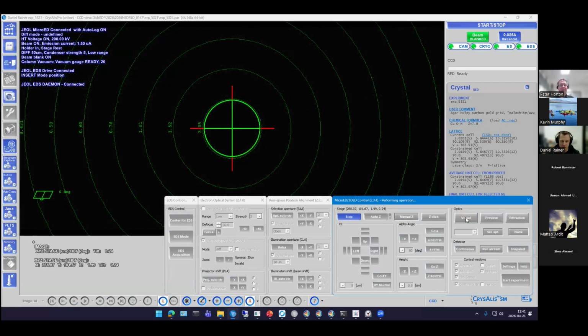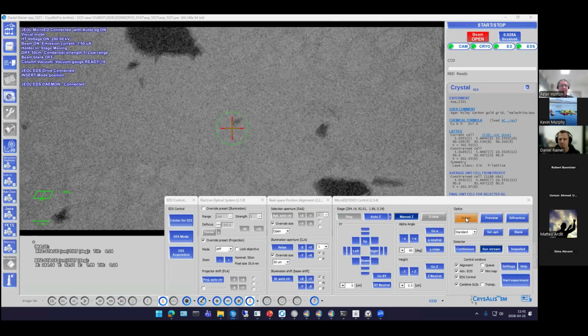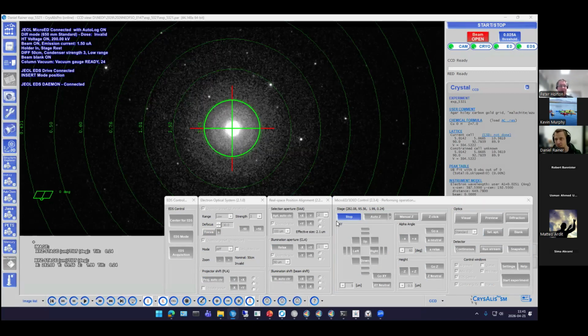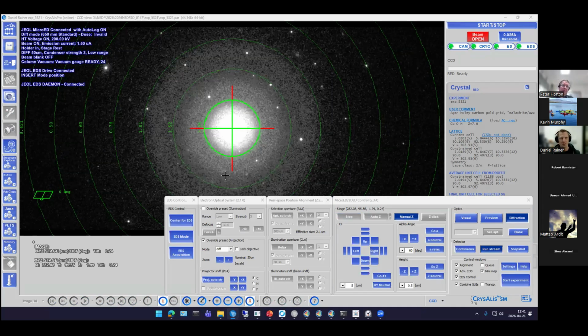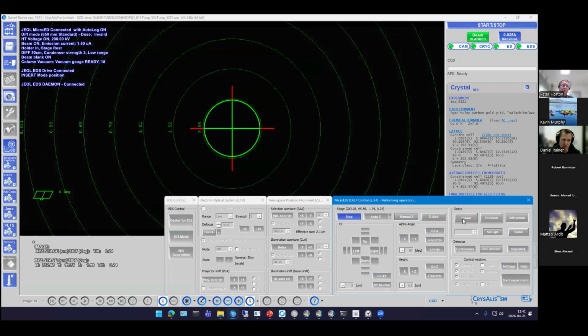So if I now go back to the crystal that I by chance found, well, I obviously selected it before. So if I go here, hopefully it's still a crystal and didn't degrade or anything. There we go. And we see diffraction, right? So not only do we see the primary beam in the center, we see very nice diffraction to quite a nice resolution. So this is a perfect candidate to perform an experiment. And actually, this is what we're going to do now.